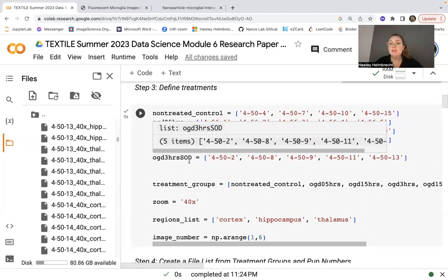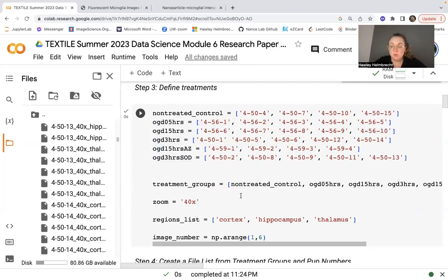So normally you want to do a study blinded, but in this case, we're not actually going to change any variables image by image, nor are we even going to look at the images at all. I ran a small test set. I built this out. I know that it works. I save all the images. I can see what happens to them. So I'm just going to deblind them here for the computer for analysis later.